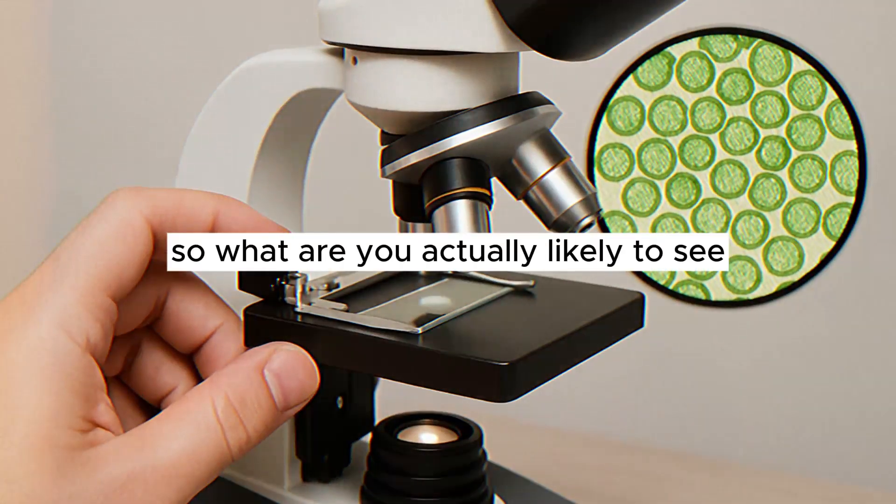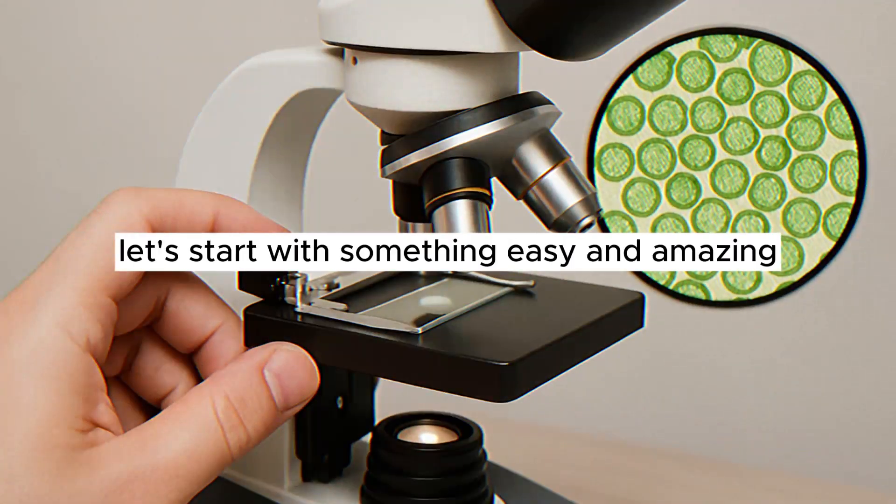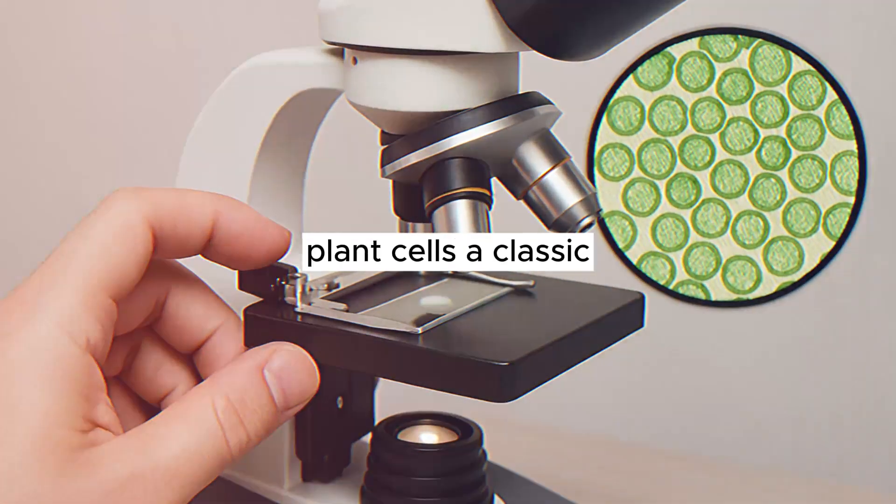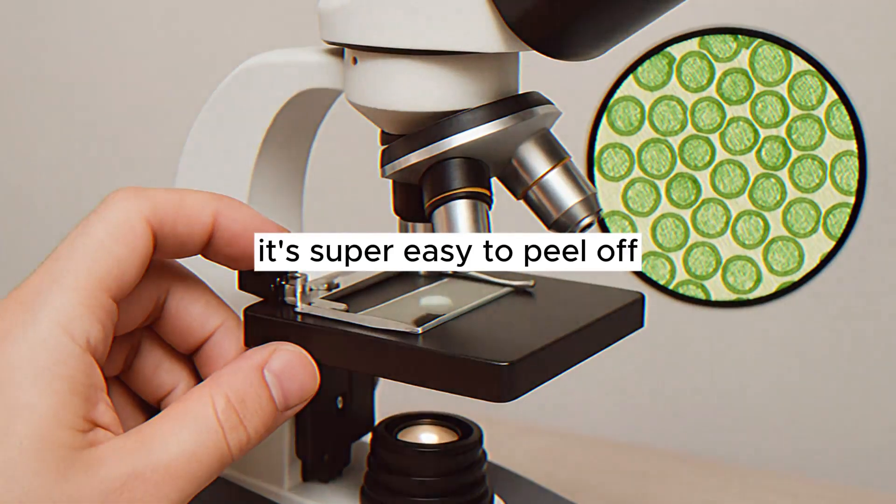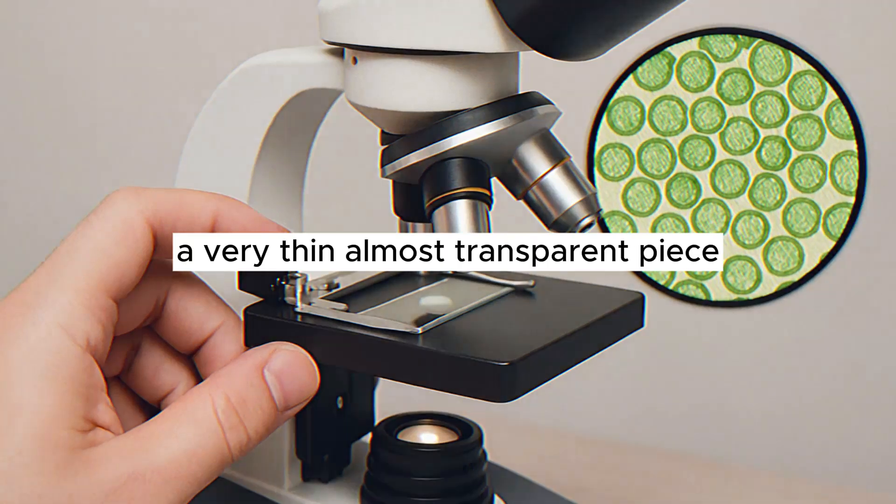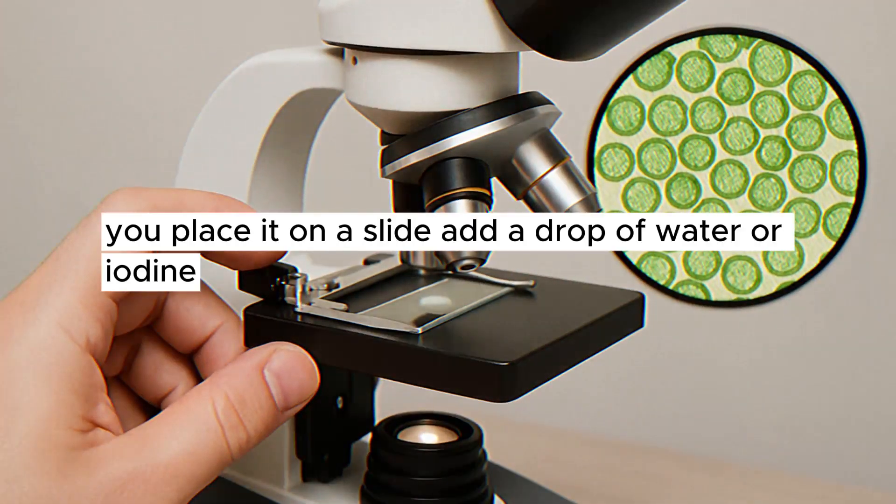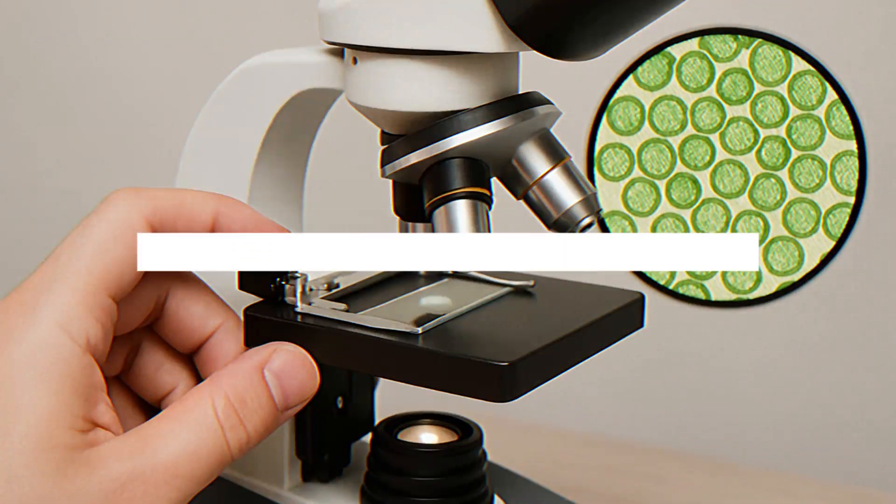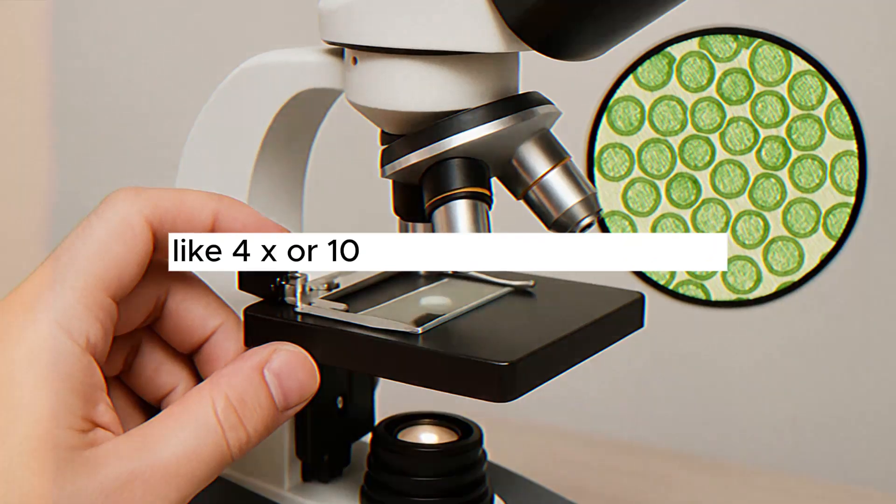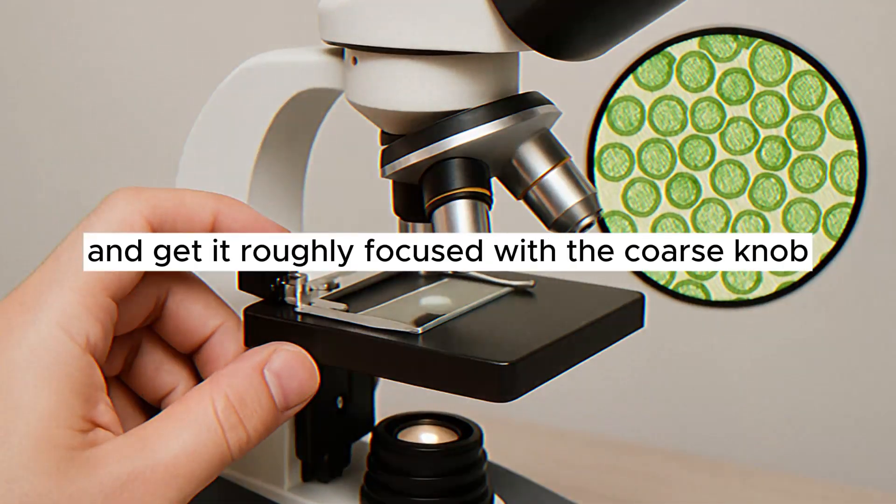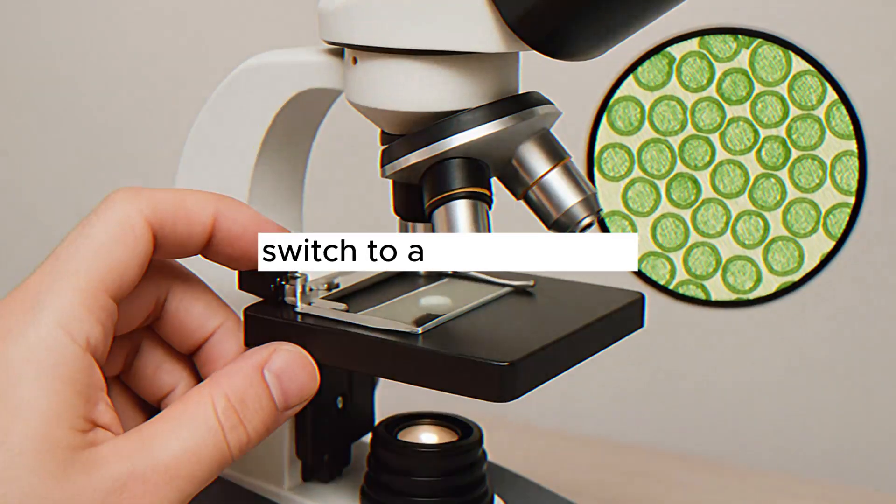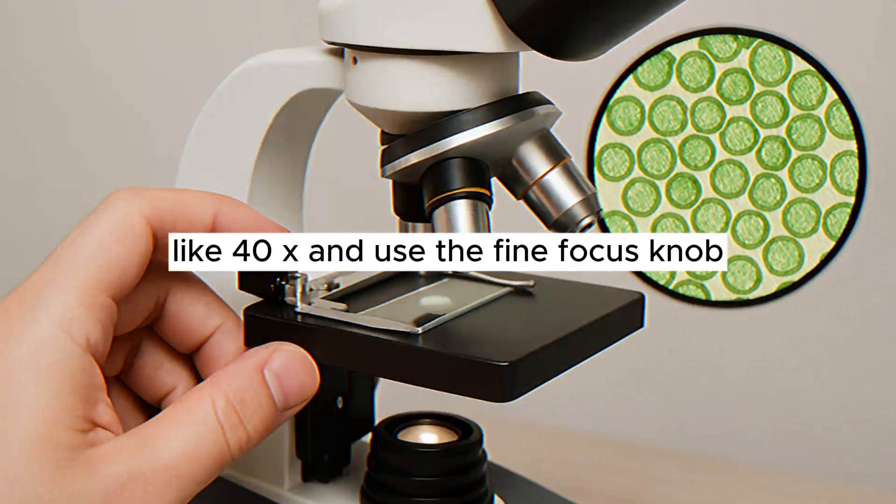So, what are you actually likely to see? Let's start with something easy and amazing: plant cells. A classic beginner specimen is a thin layer of onion skin. It's super easy to peel off a very thin, almost transparent piece. You place it on a slide, add a drop of water or iodine, cover it, and pop it under the microscope. Start with the lowest power objective, like 4x or 10x, to find your specimen. It might look like a grid or a bunch of bricks. Once you find it and get it roughly focused with the coarse knob, switch to a higher power like 40x and use the fine focus knob.